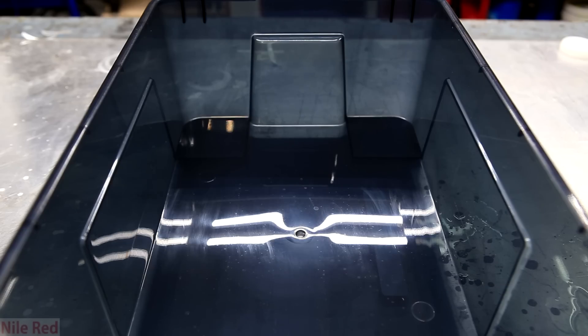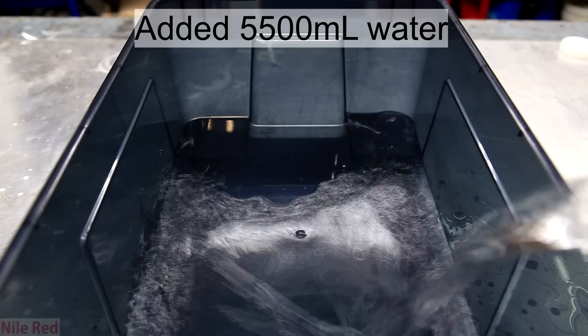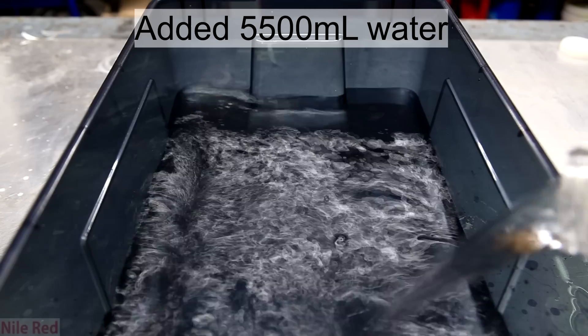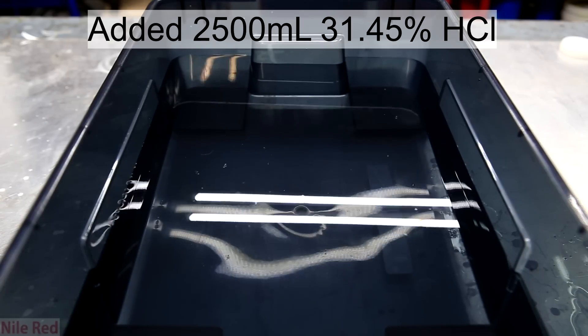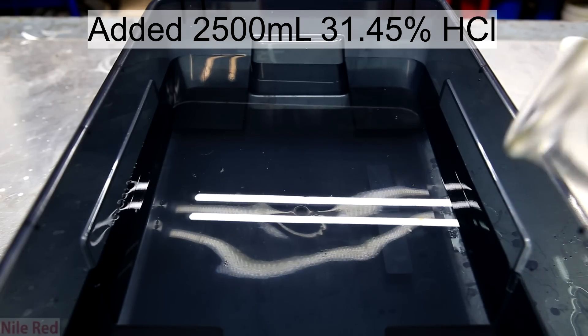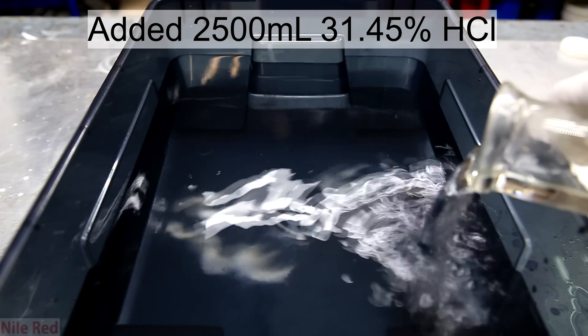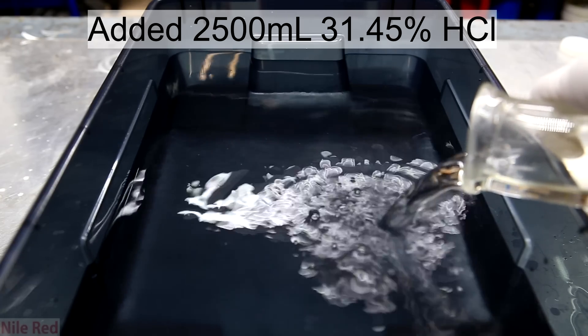First I'll show how to make the acid bath, which is pretty quick. To a suitable plastic container was added 5500 milliliters of distilled water. This was followed by the addition of 2500 milliliters of 31.45% hydrochloric acid.